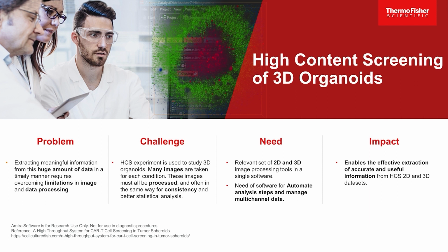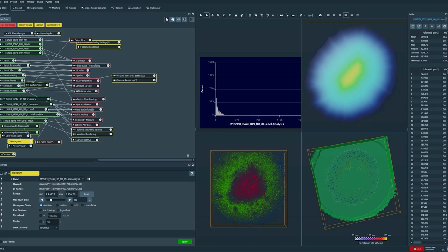Thanks. And let's go for the presentation of the second demo. So here, again, I want to show you the entire project. On the left side, this is, again, the complete workflow. So you can see different modules again. And then on the right side, you can see different visualizations.